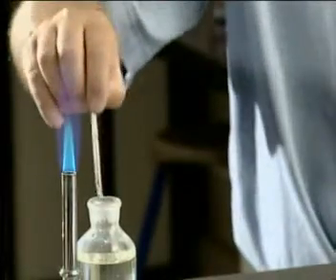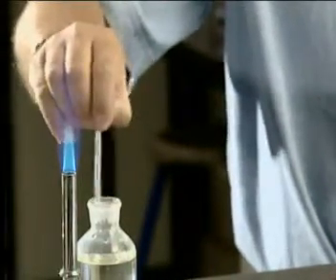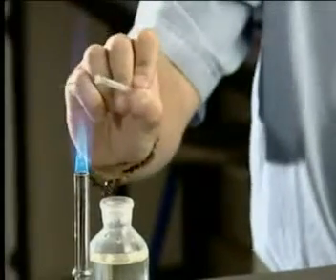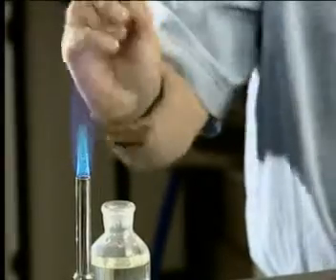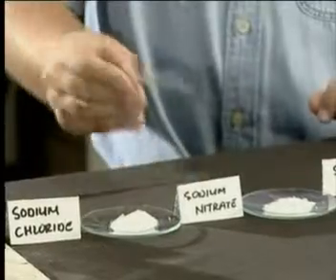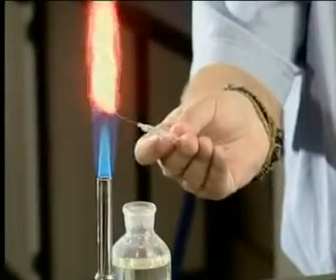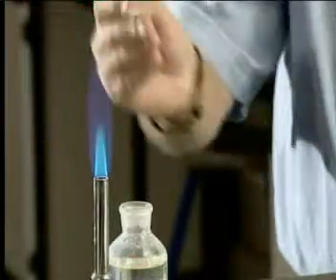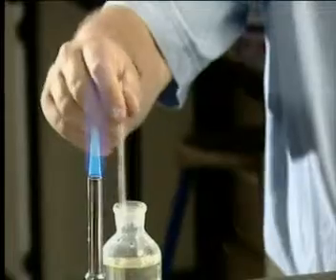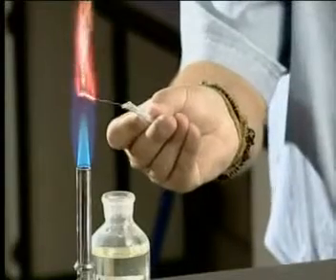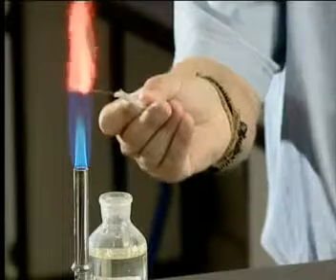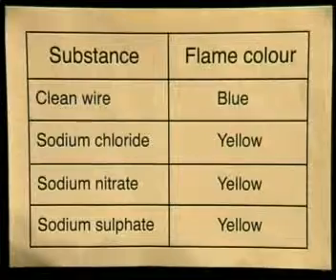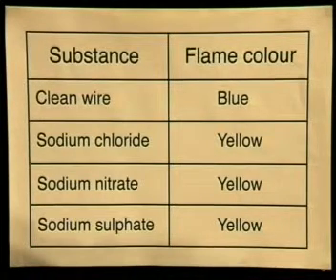Now we will test the other two sodium salts. Let's clean the wire by dipping it back into the acid to make sure that all the sodium chloride is removed before placing it in the flame. Can you see now we have a plain blue flame? Let's dip it now into sodium nitrate and hold it back in the flame. Make sure that you record all your observations. Once again, we must clean the wire so that we can test the sodium sulphate crystals. I put the sodium sulphate crystals on the wire and place it back into the flame. Again, make sure that you write down all your observations.